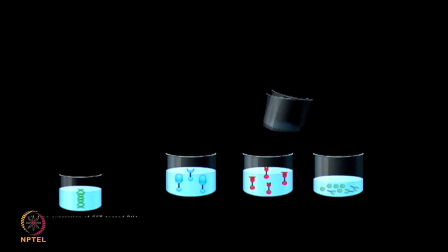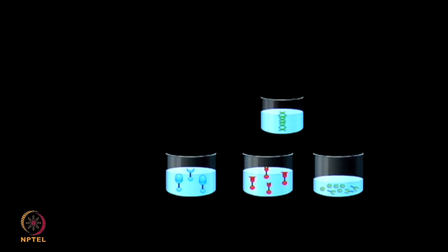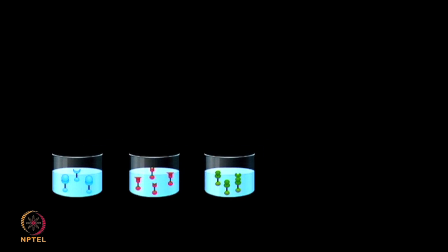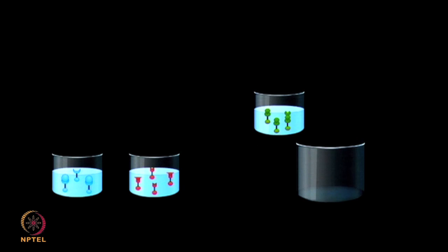Once the protein expression step was completed, the synthesized proteins were further immobilized onto the beads through the capturing agents. These beads were then mixed together.